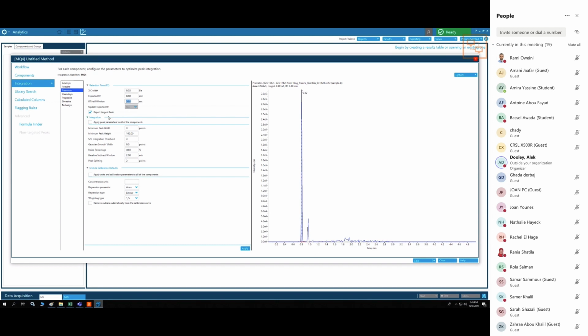to that peak. So because in this case, I think our chromatograms will be quite clean, we can leave that unchecked, and then it will jump to the closest. But you do have control of that, and also you can update this so it's not as wide. You know, even 15 seconds is a large jump in time for a peak in LCMS. So you might want to make that smaller.